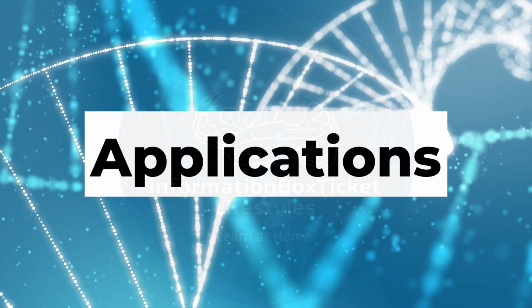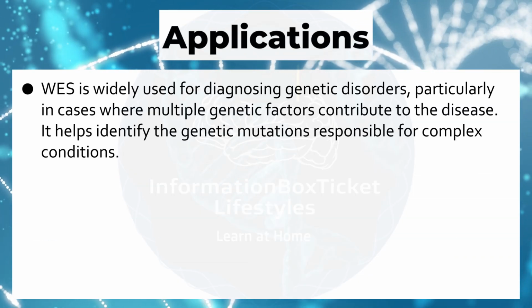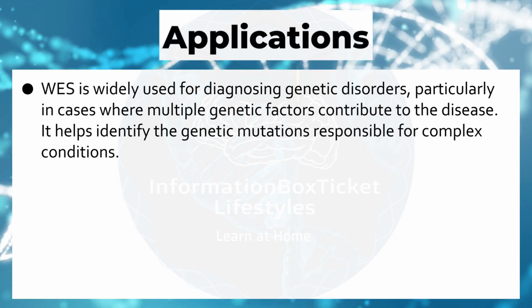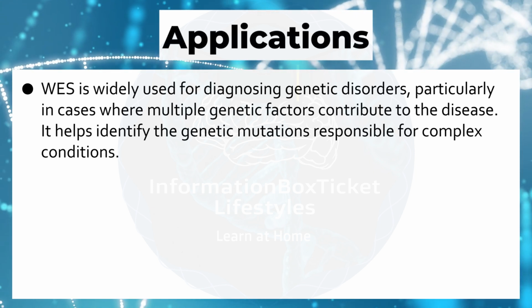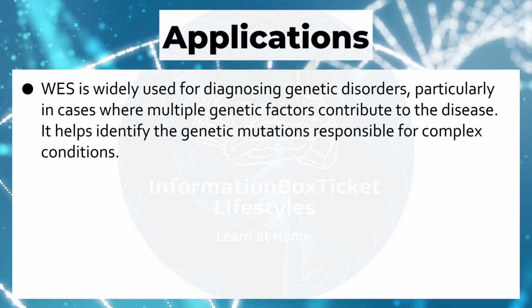Applications of whole exome sequencing. Whole exome sequencing is widely used for diagnosing genetic disorders, particularly in cases where multiple genetic factors contribute to the disease. It helps identify the genetic mutations responsible for complex conditions.